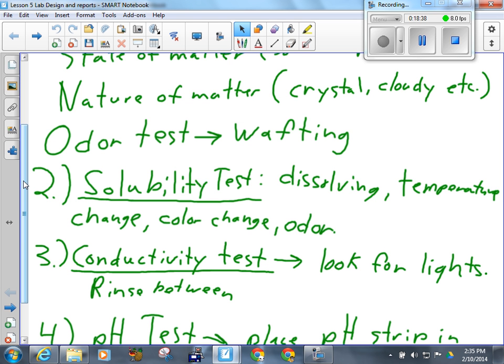People often make this mistake when they are trying to add small amounts of water to the depression plate. You also don't have to tip it. You can, but you don't have to. You just squeeze it gently, and little drops of water will come out. You kind of get it going, and then little drops of water come out. You don't have to squeeze it very hard. Easy to get small amounts in there.